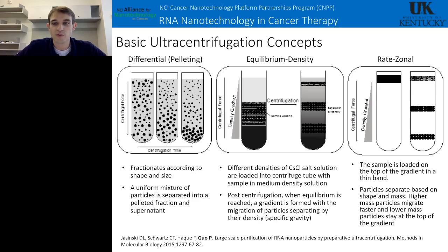And that works very well for the RNA nanoparticles because in our case, when we make a nanoparticle, it's a mixture of multiple single strands, then they form a specific size and shaped nanoparticle. And then we put them in this gradient, and they are able to separate based on size. And we separate our unannealed monomer strands from our formed nanoparticles.